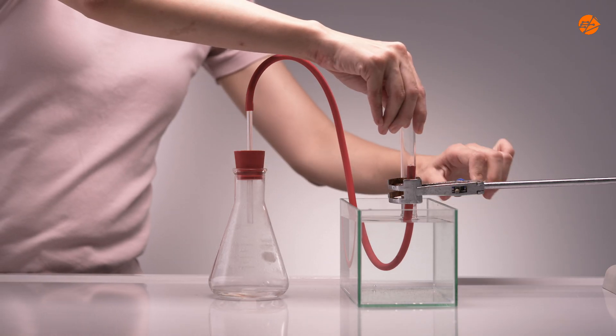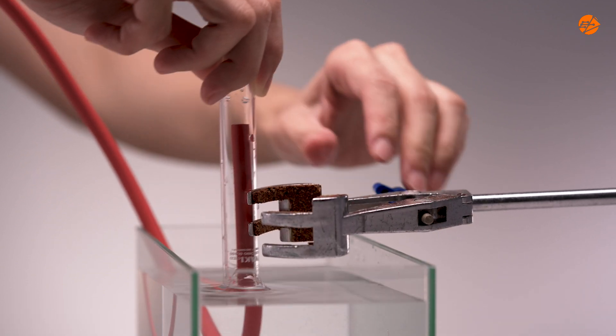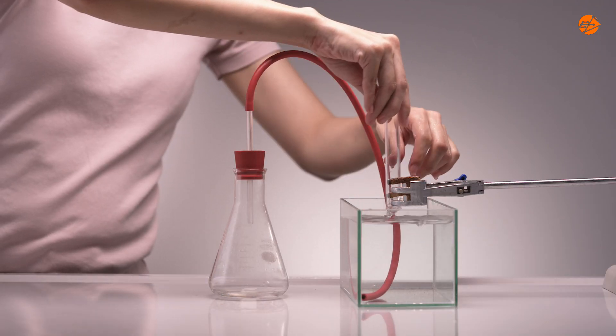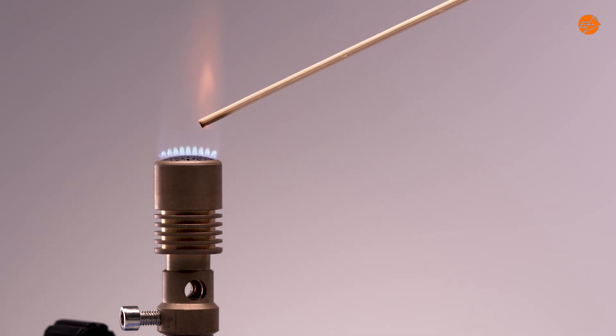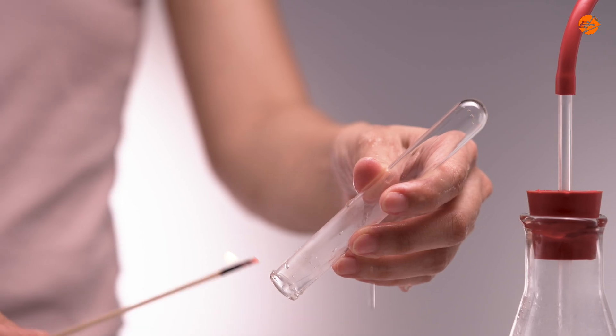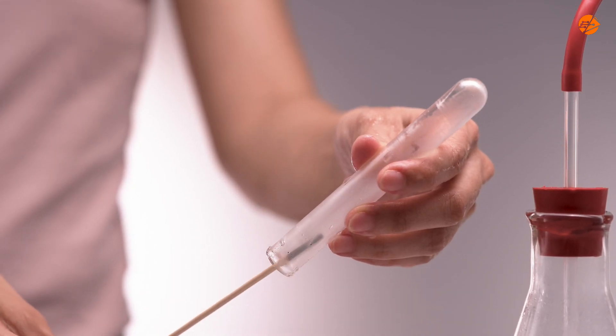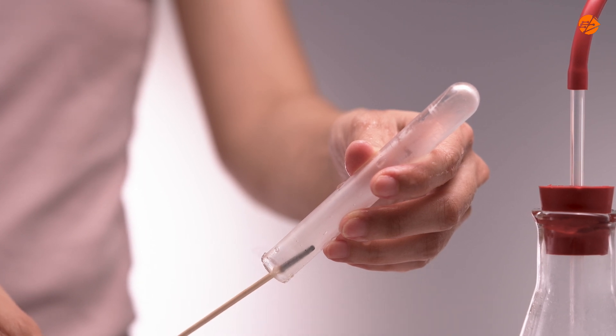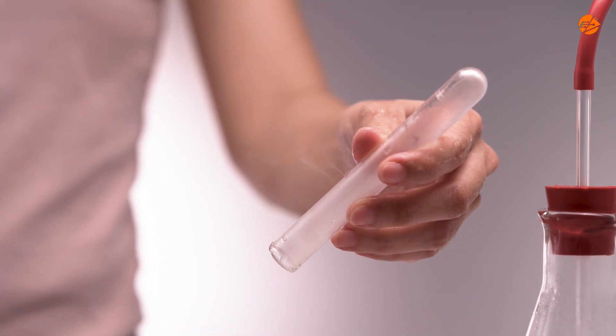After the collection is complete, remove the test tube and prepare a lighted splint. When brought near the mouth of the test tube, the lighted splint extinguishes with a pop sound, confirming the presence of hydrogen.